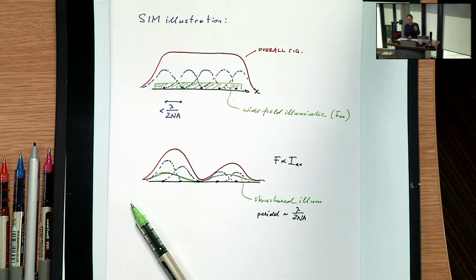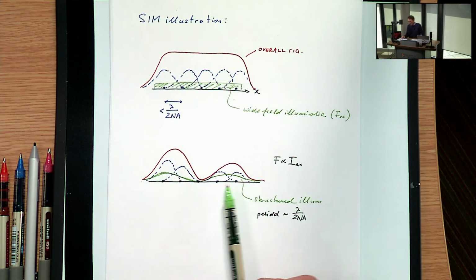So my question to you is, why do you think I need 3 images? Think about this for a sine wave illumination. And does that make sense? And why do I arrange them to be at these angles, 0, 120, and 240, or 0, 2 pi over 3, and 4 pi over 3? So if you look at that picture carefully, then perhaps you see that.